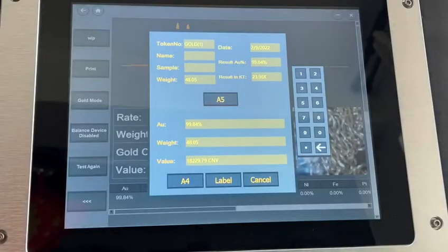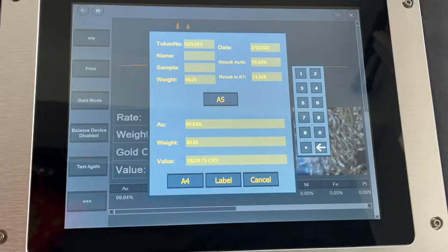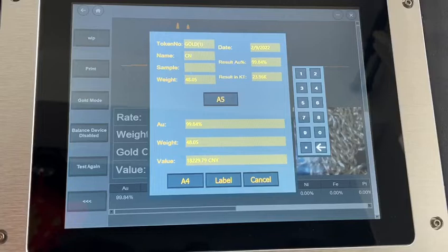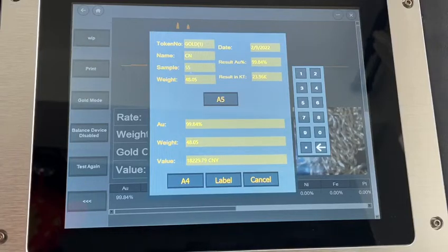Here, give it a name. C, C, M. Sample name again if you want to do something. Okay, let's say 55.